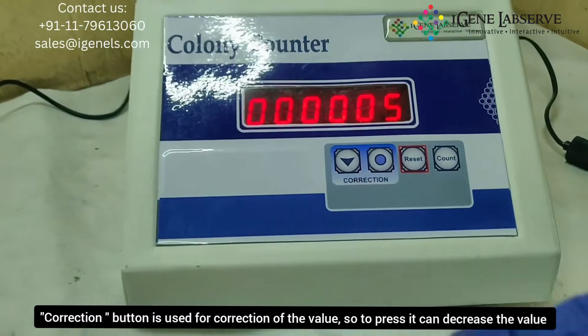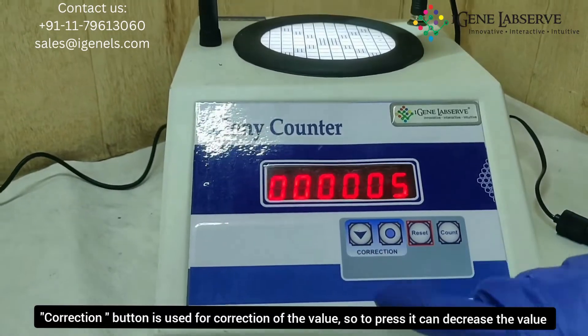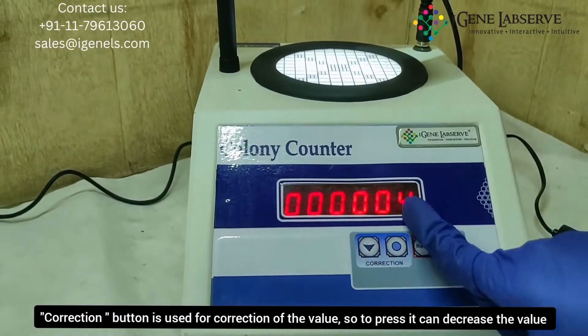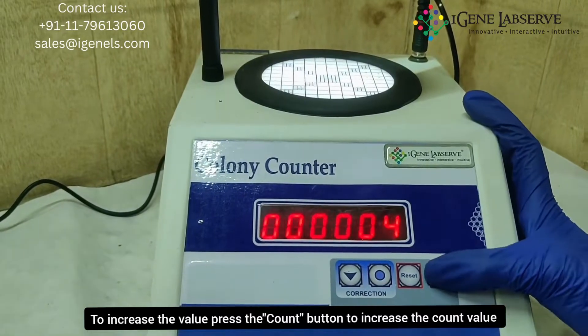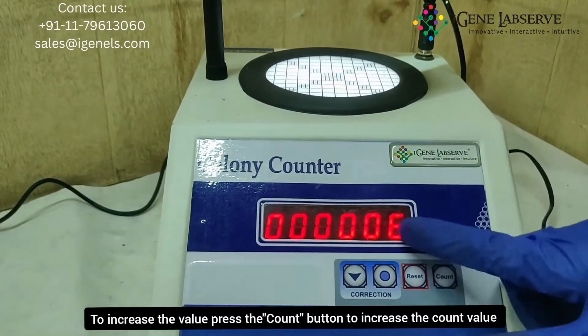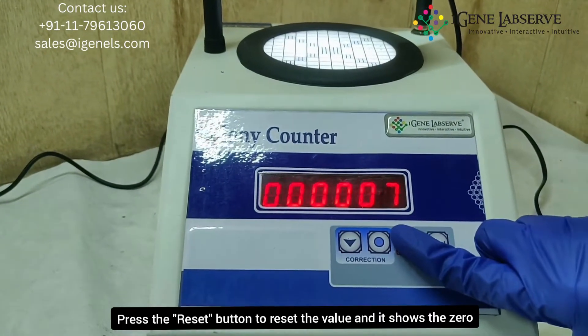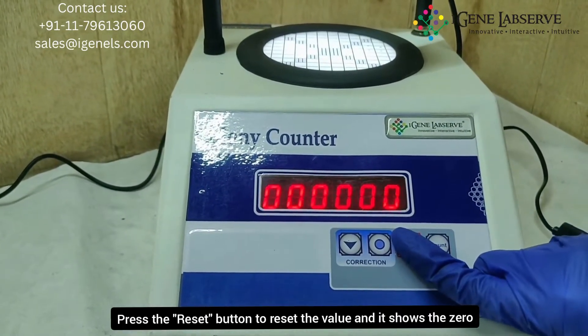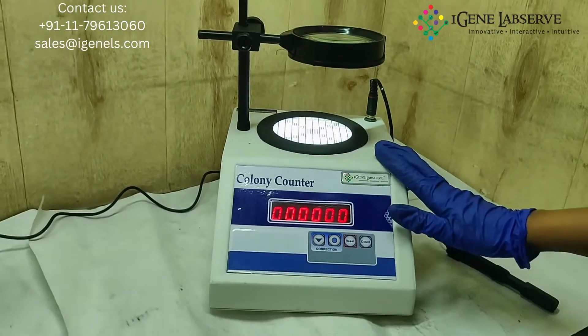This button is used for correction. You can press this particular button to decrease the value, and use the count button to increase the count. To reset this, you have to press and hold the reset button and it goes to zero. This is how the iGene colony counter works.